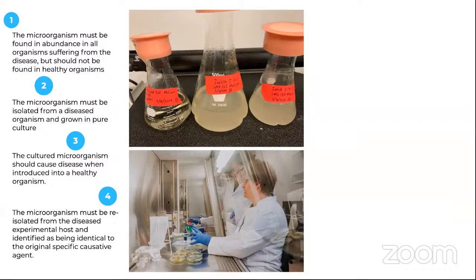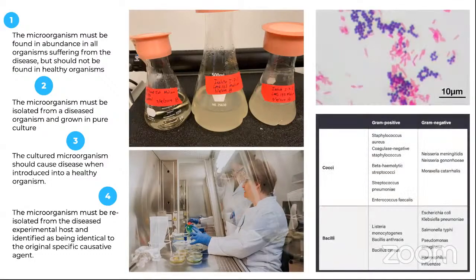Gram staining is a bacteriological lab technique used to differentiate bacterial species into two large groups, gram-positive and gram-negative, based on the physical properties of their cell walls. Gram stains are performed on body fluid or biopsy when infection is suspected. Gram stains yield results more quickly than culturing and are especially important when infection would make an important difference in the patient's treatment and prognosis.